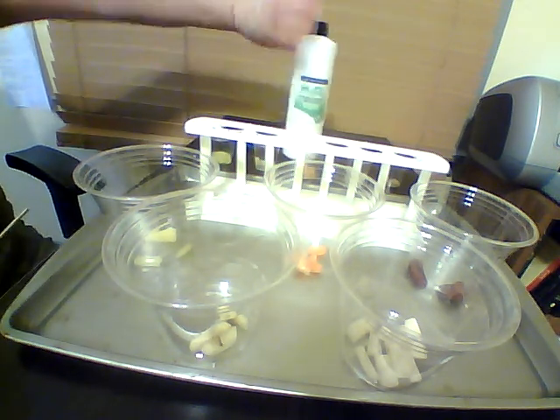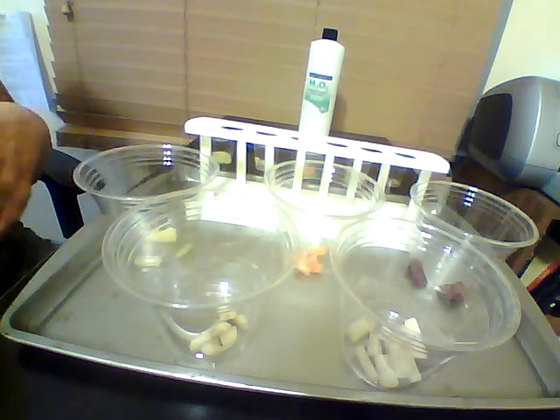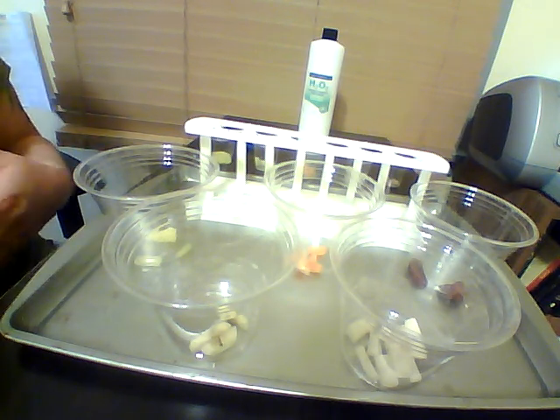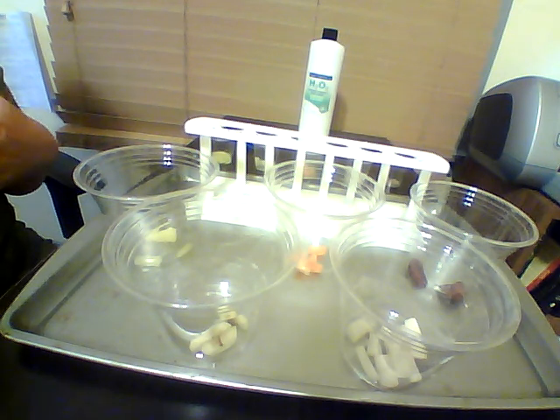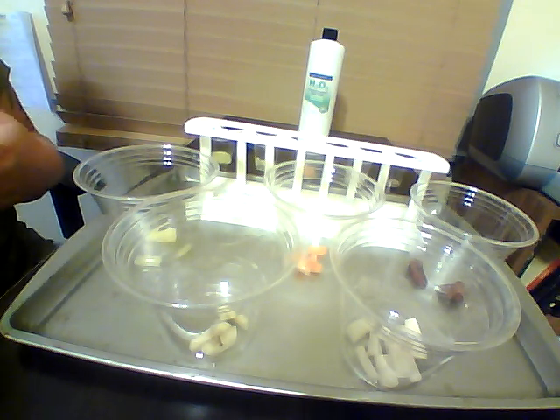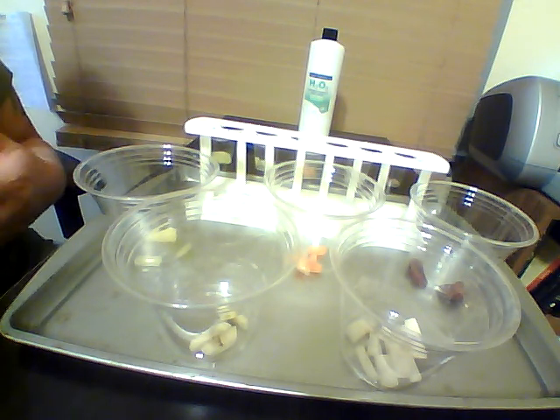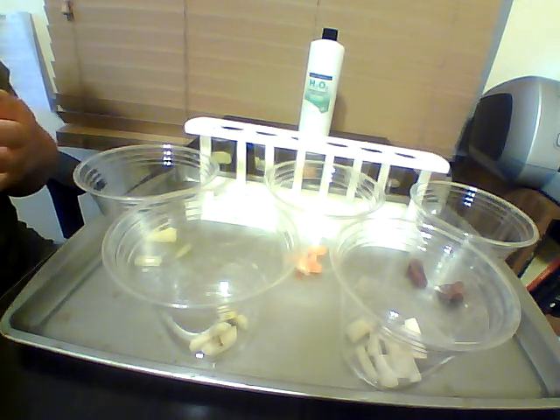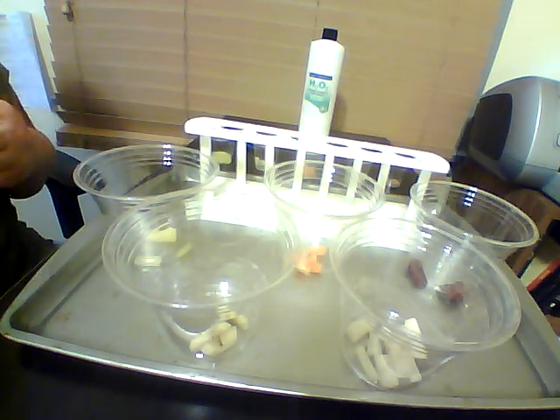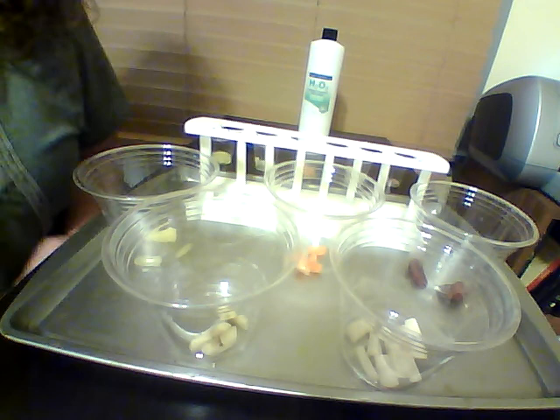This one's easier to see. So H2O2 is hydrogen peroxide. It's actually toxic to our cells, yet our cells produce it. Most things that use oxygen will produce some amounts of hydrogen peroxide, and since it's toxic to our cells, our body needs a way to eliminate it very quickly. So what we have is an enzyme called catalase, and almost every living cell has catalase in it, some a lot more than others. So today we're going to look at what that reaction looks like, and we're going to experiment on changing some different factors and seeing what happens.